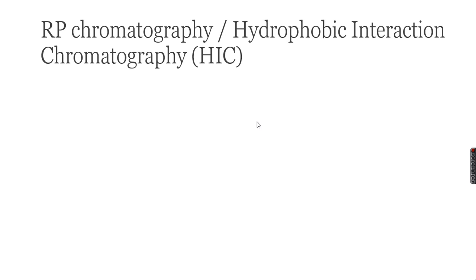This class will be discussing reverse phase chromatography or hydrophobic interaction chromatography, which is used for downstream processing applications. By reverse phase, we mean that the mobile phase used is more polar than the stationary phase. So the stationary phase in this case will be mostly hydrophobic.